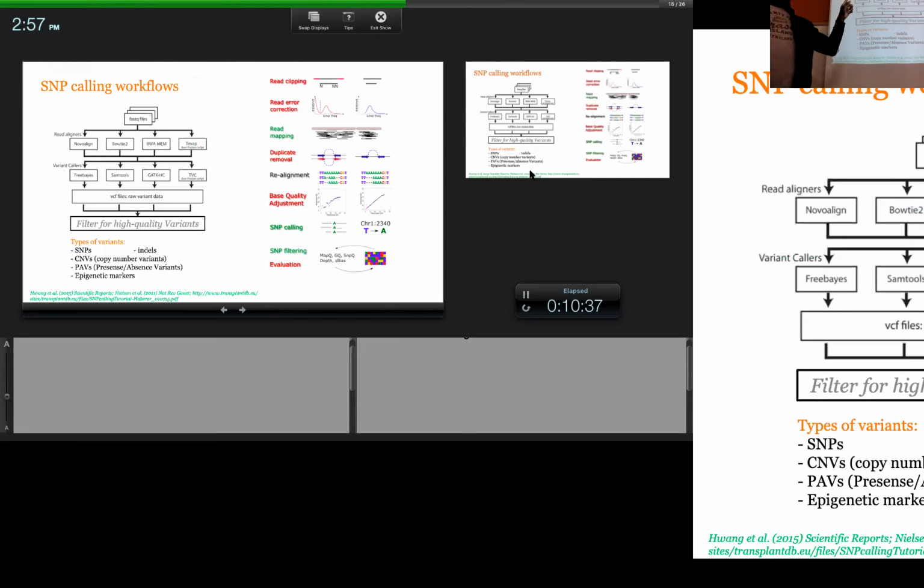Did we talk about how to prevent duplicates? How do you prevent or minimize optical duplicates or PCR duplicates? We talked about it on Monday, and I talked about it again today. I know it's a lot of moving parts. Something about PCR bias.